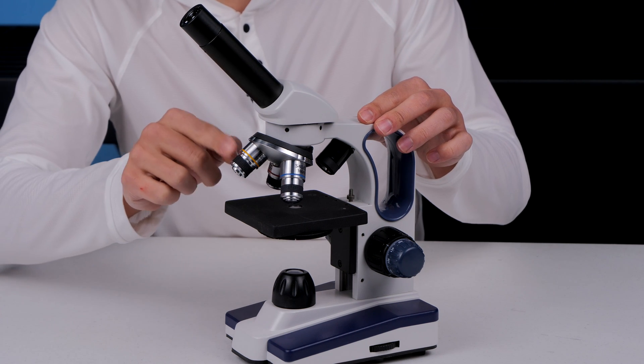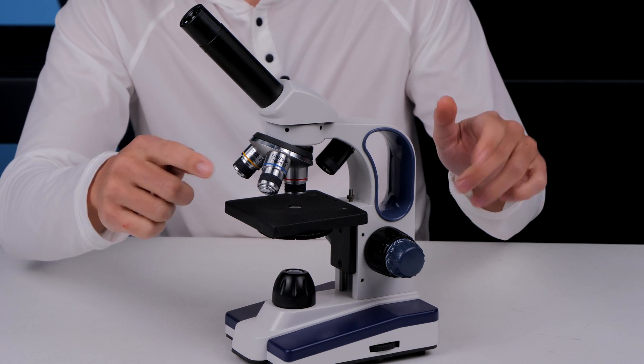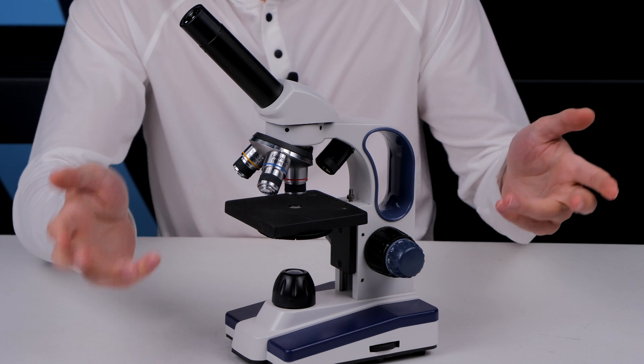I've been able to get away pretty nicely with just 10x objectives, but 40x is going to be kind of the max magnification that you're going to want for this. Anything higher than that and you're in the realm of things being so difficult to do that the benefit just isn't there.